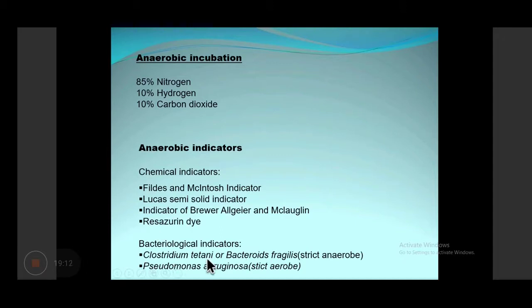So these bacteria tell about the conditions of aerobic or anaerobic, or strict aerobes.